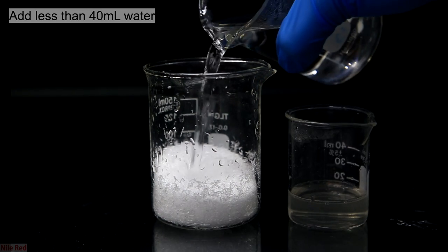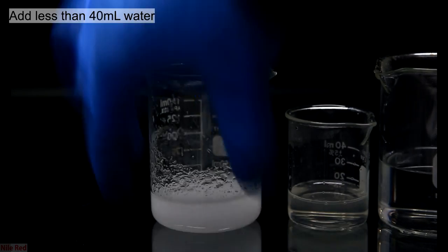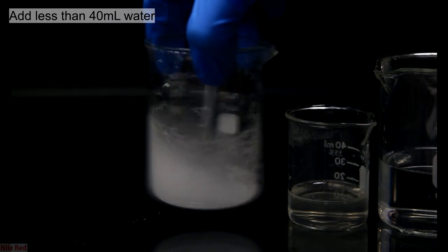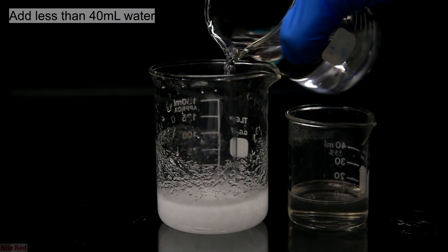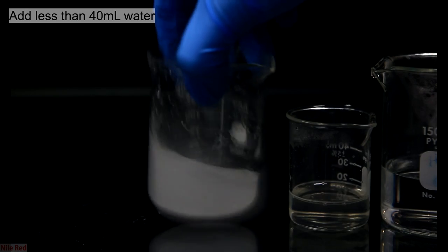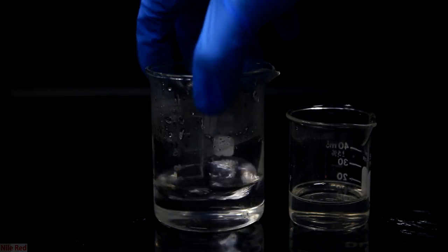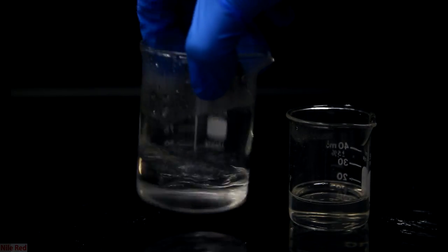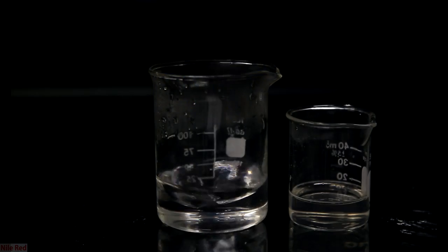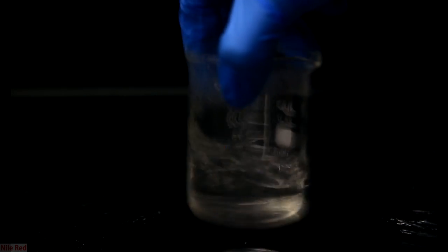To the urea, I start adding some warm water to dissolve it as well. When urea dissolves, it's endothermic and it will cool down the solution. I added a total of about 30 milliliters of water, but the total amount doesn't have to be super precise — just try to make sure you don't add more than 40. To dissolve everything, I put the urea solution in the microwave and kept adding small amounts of hot water until it fully cleared up. Now that we have two clear solutions, the gelatin solution is simply dumped into the urea solution, and we're left with a nice clear solution of gelatin and urea.